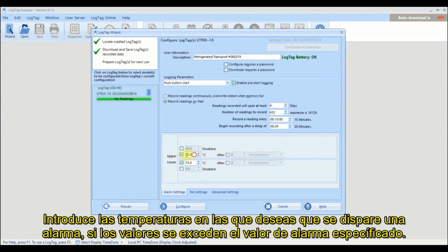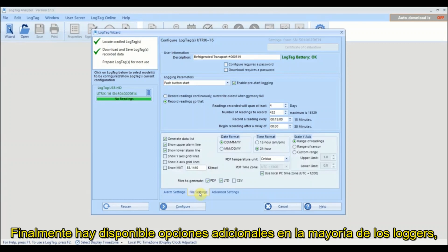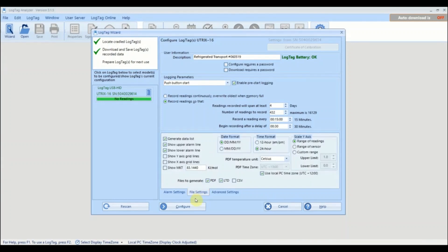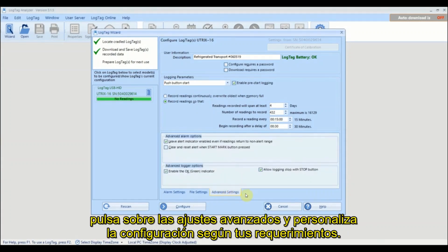Enter the temperature values that will trigger an alarm if readings exceed the specified alarm temperatures. Finally, there are additional options available on most loggers by clicking on a tab and customizing the settings to meet your requirements.